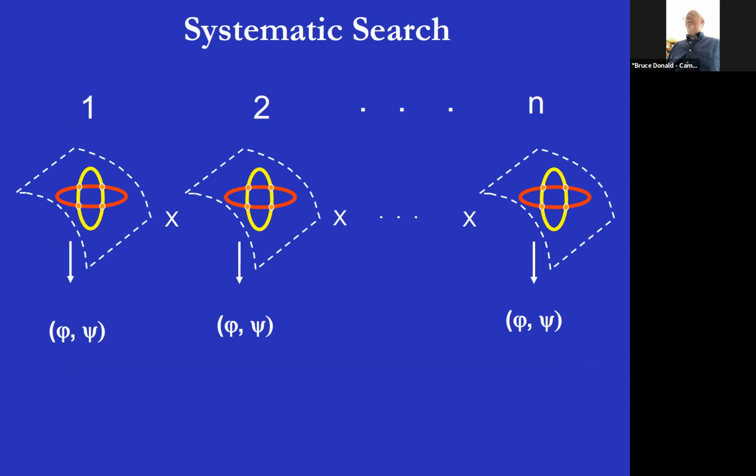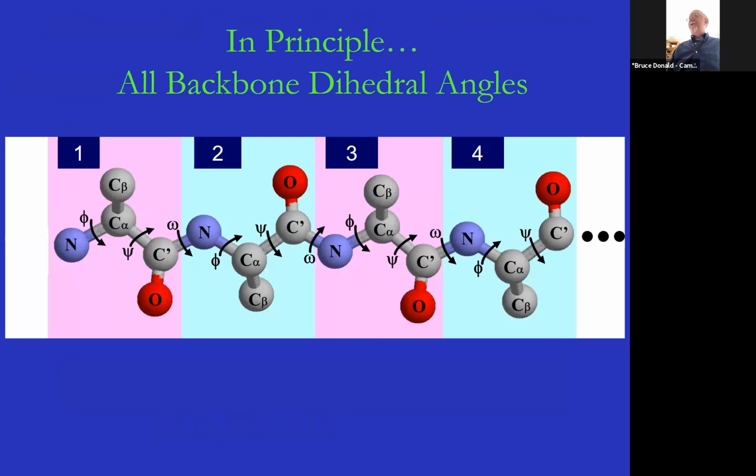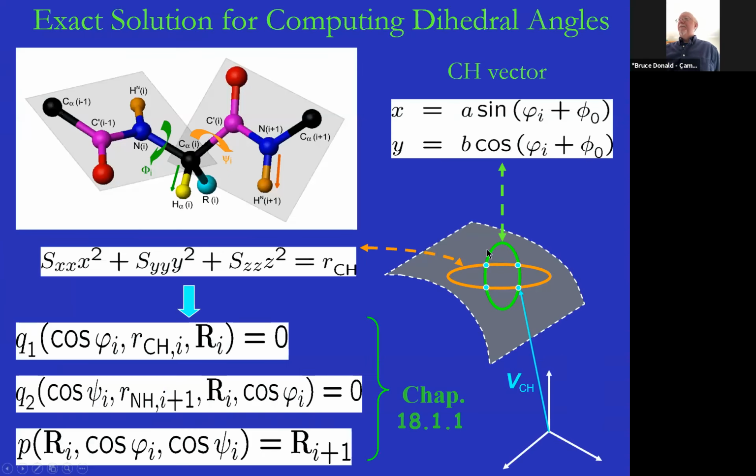All right. So a quick question. Yeah, absolutely. If we're doing this kind of inductive process where each solution depends on the solution to the one before it, don't we kind of lose some of the benefit of having globally independently defined RDCs where errors won't correlate and build up? Errors can't build up because the orange ellipses are fixed. They don't change, right? So this ellipse is always the same. It's not influenced by anything previously. It's always globally referenced.